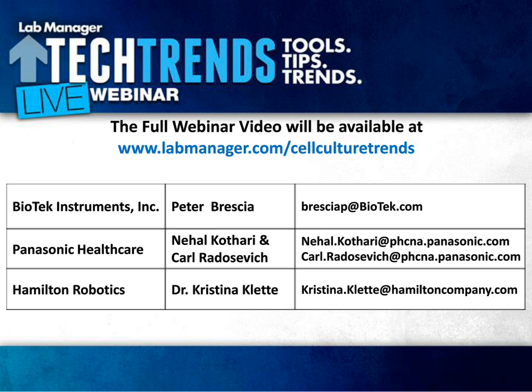I can add to that too, as a trend more than what's missing. As Carl mentioned, the tools are there. I think it's just finding an efficient and effective way, from my perspective, to integrate them together so that a researcher can perform a whole cell culture process or cell-based assay process in an automated fashion to increase their throughput.